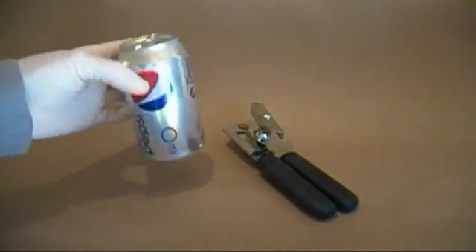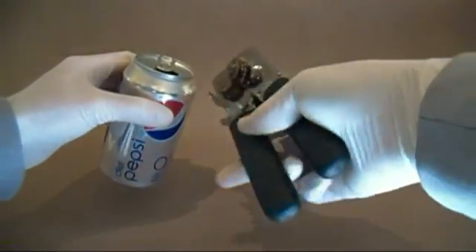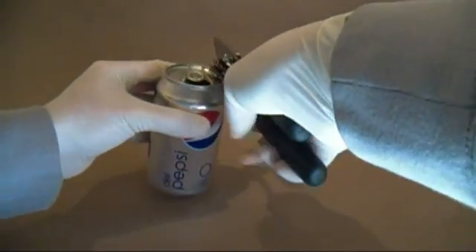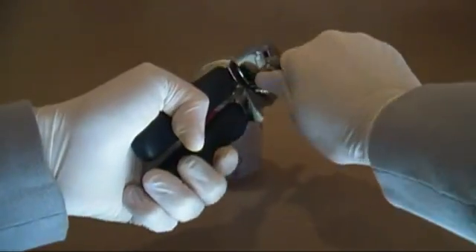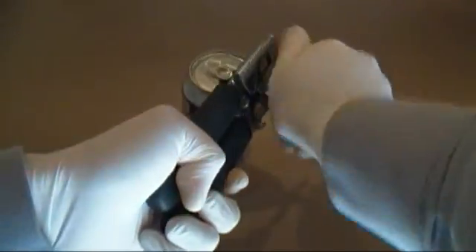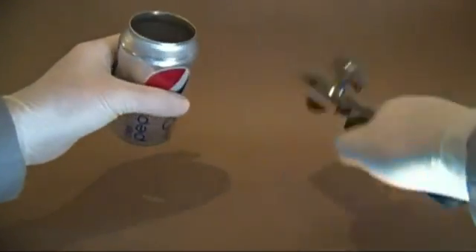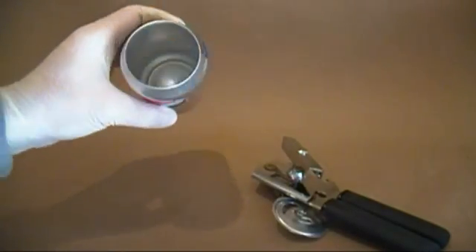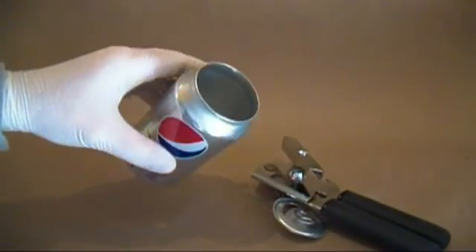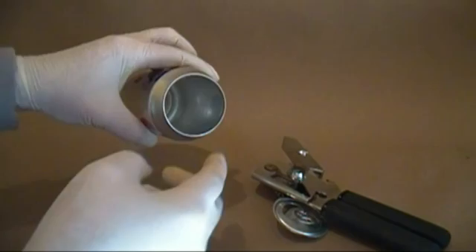Glass beakers are expensive. If I can, I like to do messy reactions in something I have not invested a lot of money in. Take an aluminum can and grab a pair of can openers. Use the can openers on the lip of the can and remove the top just as you would a can of soup. Cutting out the top like this leaves no sharp edges. You now have a disposable beaker. You can even boil things in it. The only drawback is that you can't put anything in it that reacts with aluminum.